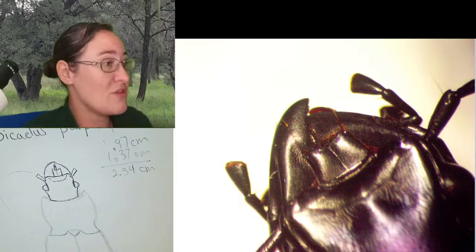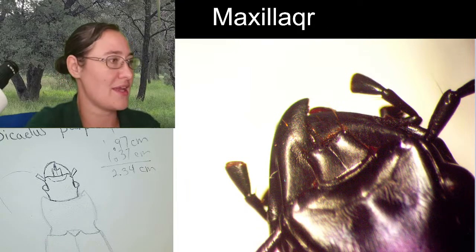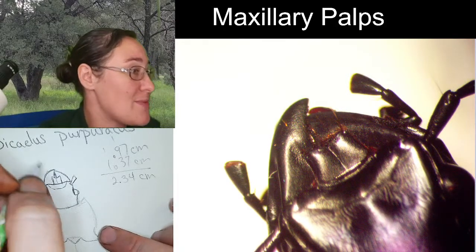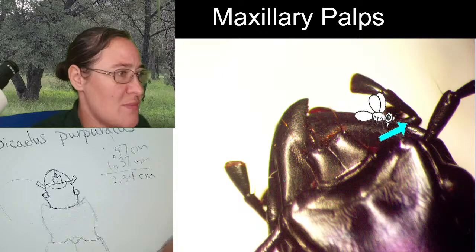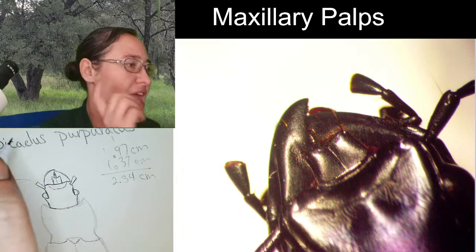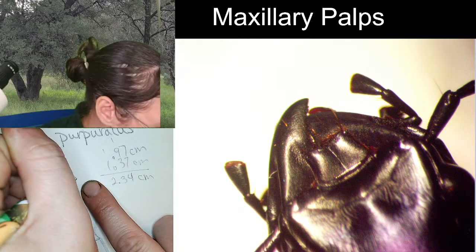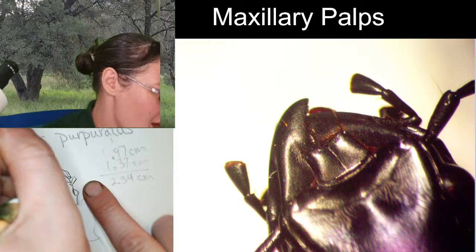The palps that you can see here, the mouth fingers, those are maxillary palps. These ones right here. From what we can see, two segments. We might actually see three segments. There looks like there's one right here that comes out, and then two, three. It might have more if we look at it from the side, but those are what we can see from the top. So I'm going to add the one little small one here. And then two. And the third one is very triangular. It's really wide at the end.